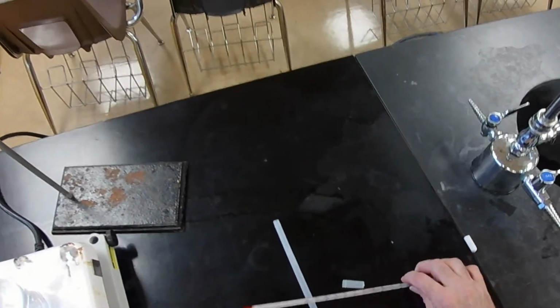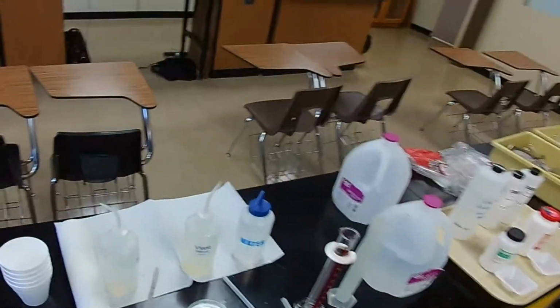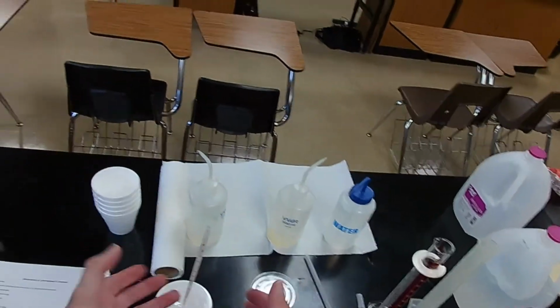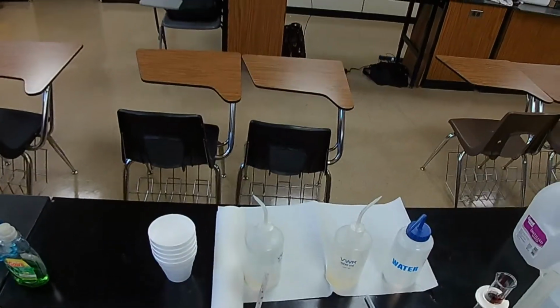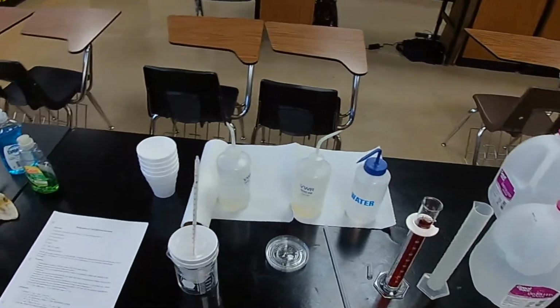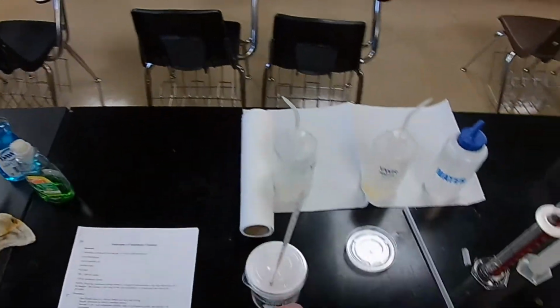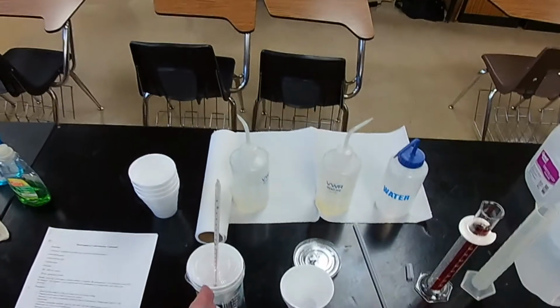Now, the key to using a calorimeter is that you know the temperatures right before the reaction takes place, which means you'll have some of the reactant or water, whichever the case may be, in the calorimeter, and you'll know that temperature. And anything else you add to it that you need to know the temperature of, you'll get the temperature immediately before you combine them. So here's what we're going to do. We're going to use another styrofoam cup to hold the hot water. We'll put the room temperature water, which we call cold water in this experiment, in the calorimeter.